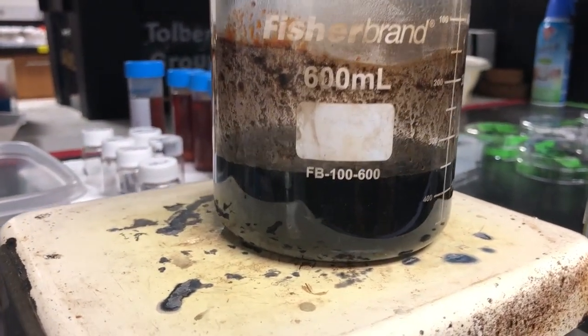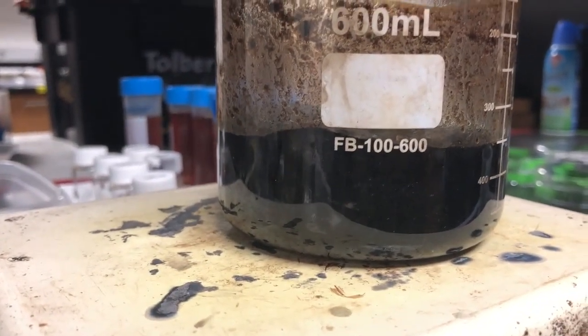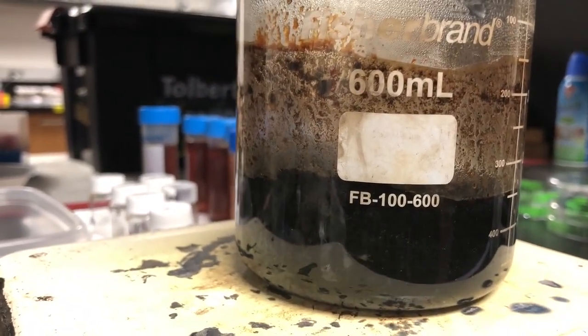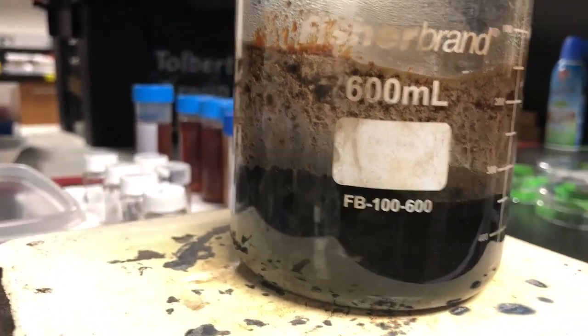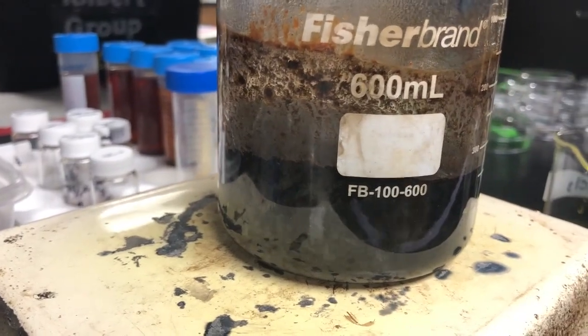Our solution has just barely started to boil, and what you'll notice is as the solution starts to boil, the solution will begin to clump up, so you'll get black particulates crashing out of the solution or separating. So once it has gone to a nice roaring boil, we can take it off the heat.